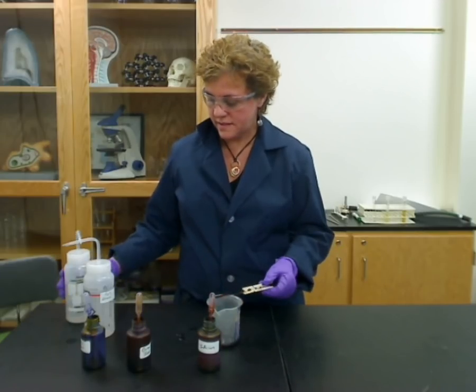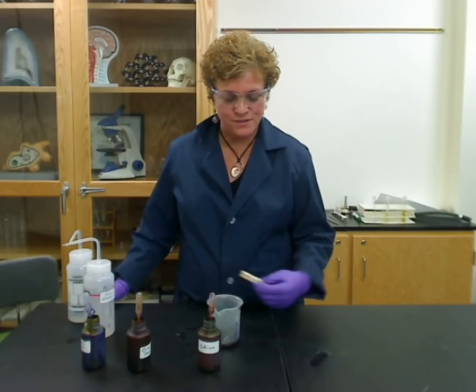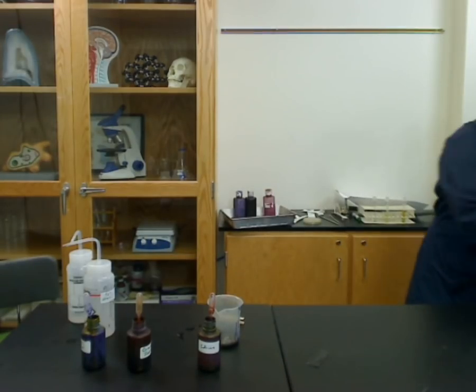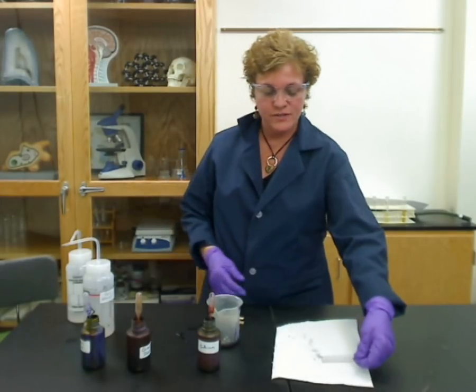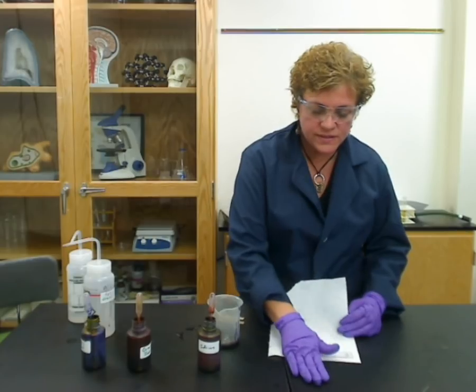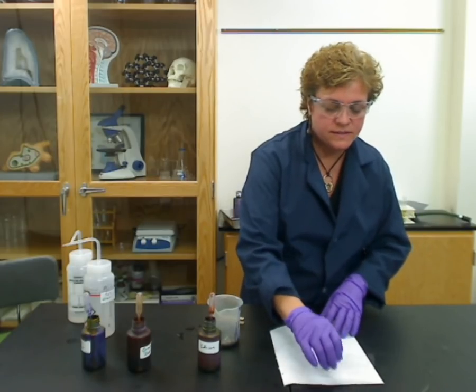After a minute, dump off the safranin, rinse it, and put it onto a paper towel that you should have right there. Once you're done rinsing, I usually turn it upside down on a paper towel — or if you've got a bibulous paper book, a lot of people use those. Then fold the paper towel over and blot it so that you're getting all that water off before you put it on the microscope.